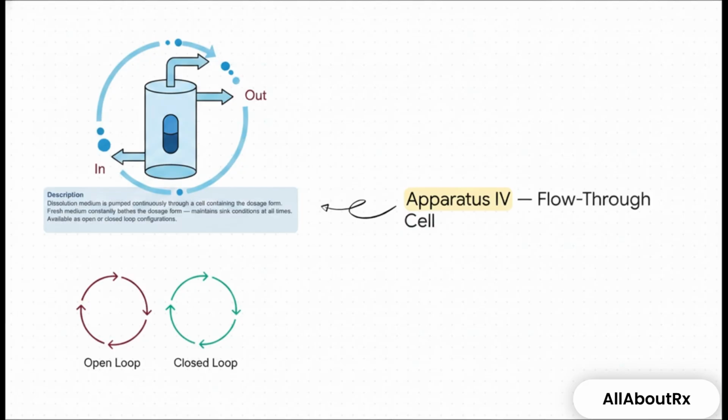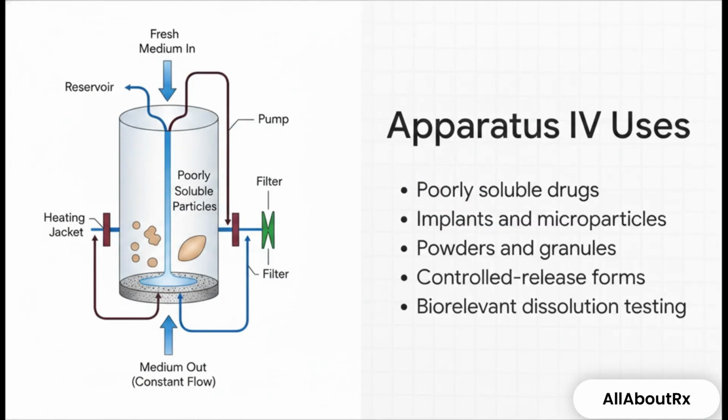And you can set this up in either an open or closed loop. Because the medium is pumped continuously, this setup maintains what we call sink conditions at all times. Basically, that means the solvent never ever becomes saturated.